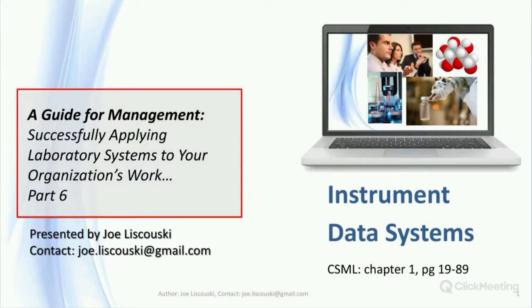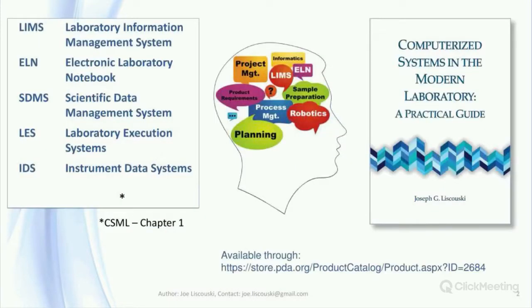The floor is yours. All right, thanks, and welcome to the 6th session in this series. We'll be looking at instrument data systems as part of our discussion of laboratory informatics. This will include the roles and education of laboratory personnel and IT support. As we've noted in these webinars, this companion book will provide useful background information on the technologies, support, and other factors that can impact your ability to effectively use these systems. It should prove to be a useful reference as the webinars get into more technical details. Much of the material in this session is expanded on in Chapter 1 of the book.